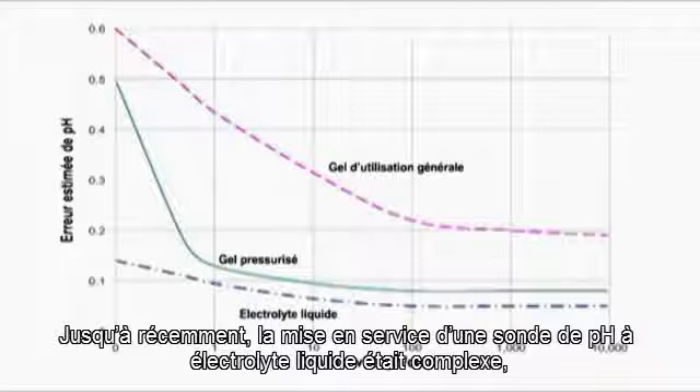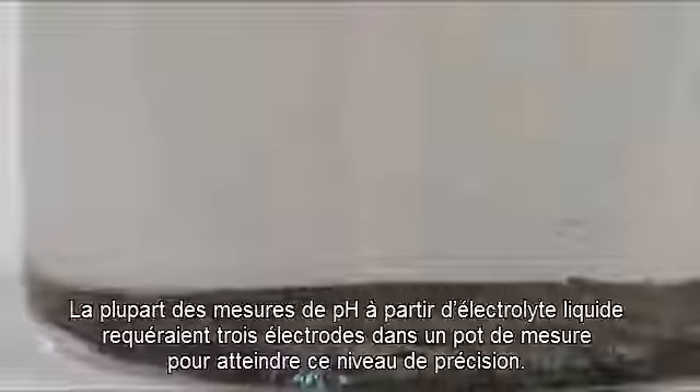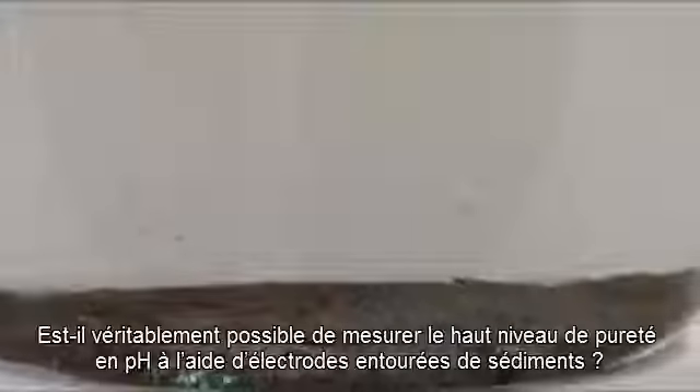Until recently, implementing a liquid-flowing electrolyte pH sensor has been cumbersome and requires labor-intensive, complicated maintenance. Most liquid-flowing electrolyte pH measurements require three electrodes and a flow bowl to approach this level of accuracy. Can you really measure high-purity pH with electrodes surrounded with sediment?